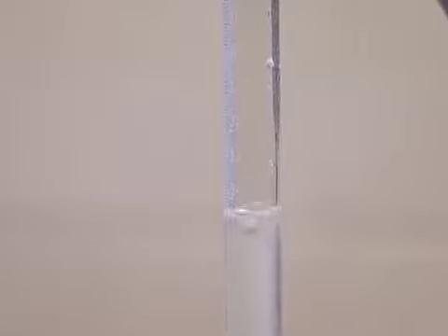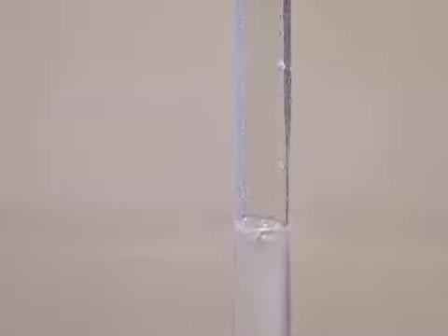Now we'll just wait together on this one because it's very interesting how this works. That hydrogen is forming those bubbles. Show me that there's a gas forming here. We want the magnesium to be completely dissolved, the reaction to be complete. Sometimes it takes longer than other times. But the bottom line is we just have to be patient.